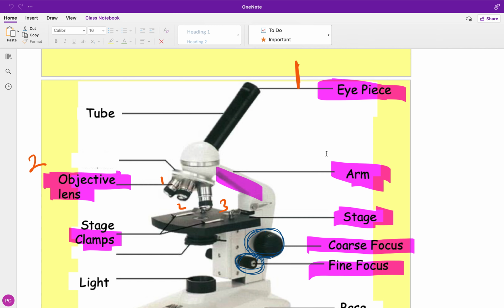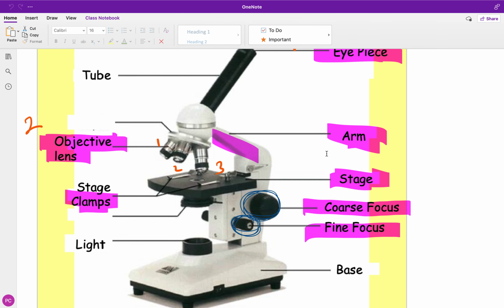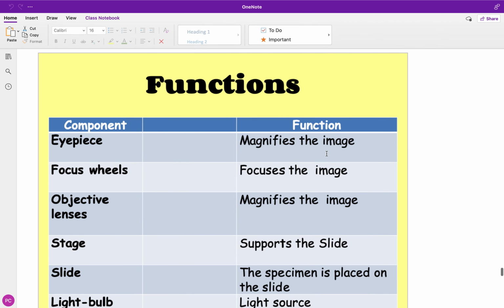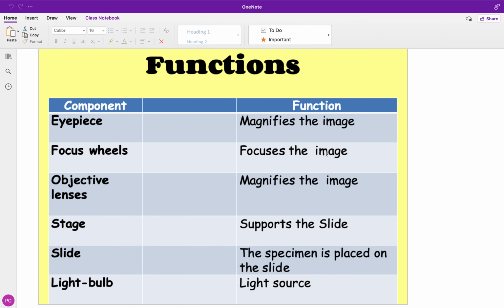And before you started all this, down the bottom of the microscope, you had the light. So you have to turn the light on. Because when you turn the light on, the light shines up and up and up into your lens, up through and into your eye. And that's what allows you to see. And the reason it was difficult to see your pen was because the light couldn't travel through the pen. That's your microscope.